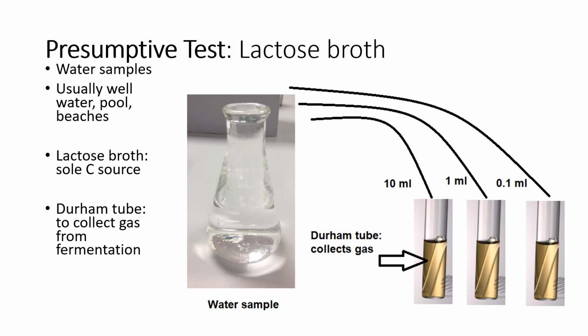And okay, so we would test this water sample, and we would do it in 3 different tubes. Okay, the tubes would have lactose broth. That would be the only thing in here. It'd be lactose and water. Okay, lactose is a sugar, and it's a food source.